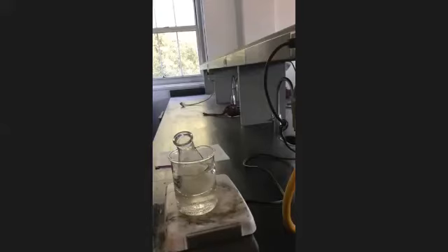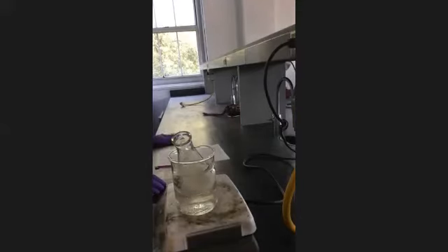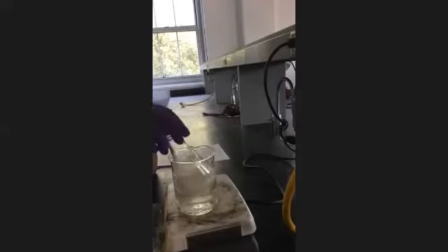I only had two accidents in lab the whole time I've been teaching here, 15 years. One was a student, we were doing a reflux and a student turned the transformer up too high and their whole thing just exploded. So we had to evacuate the third floor. The other accident was we were doing aspirin recrystallization and they were heating up ethanol and they heated it past the flash point, and the whole thing had fire coming out of the top of the Erlenmeyer flask.